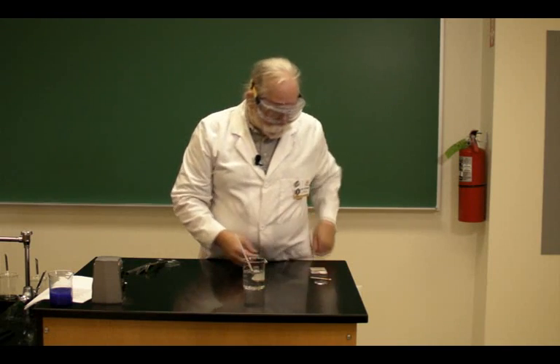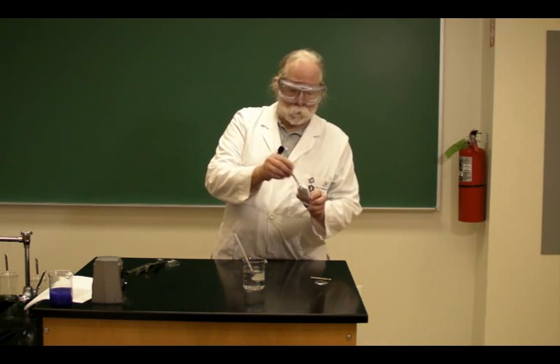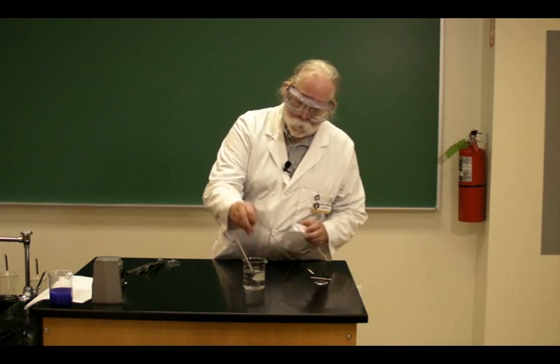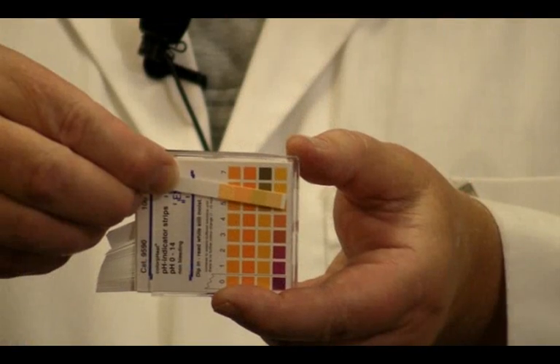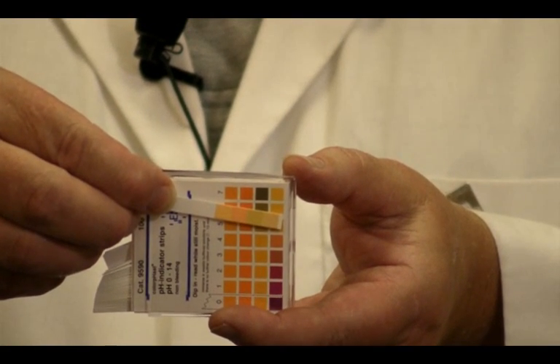Let's check by testing the pH of the solution. It's now closer to 5 than it was the 7 as pure water.